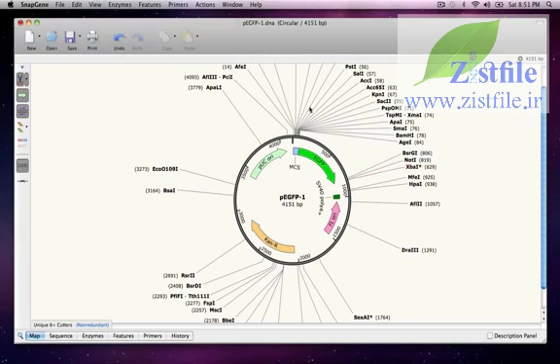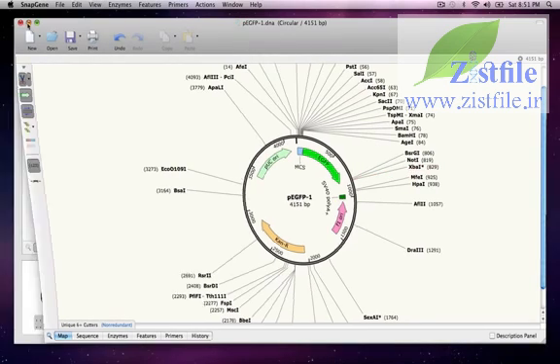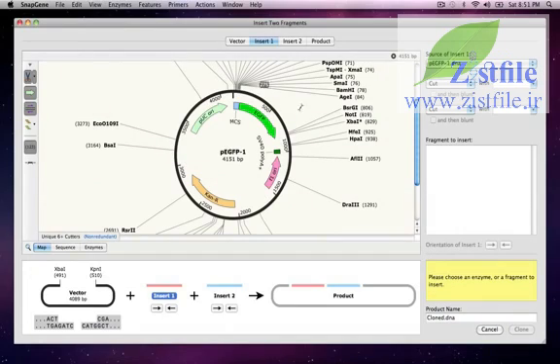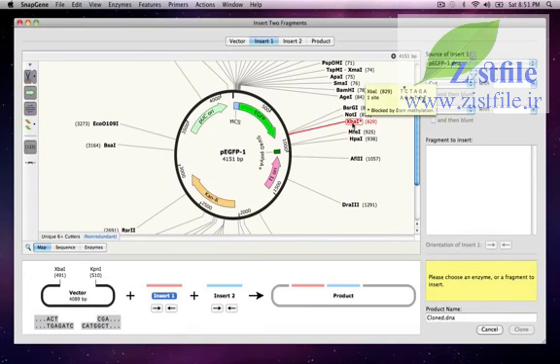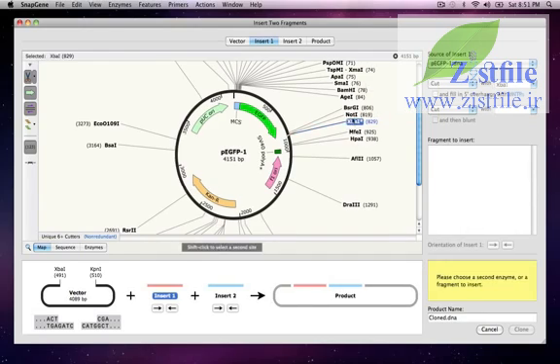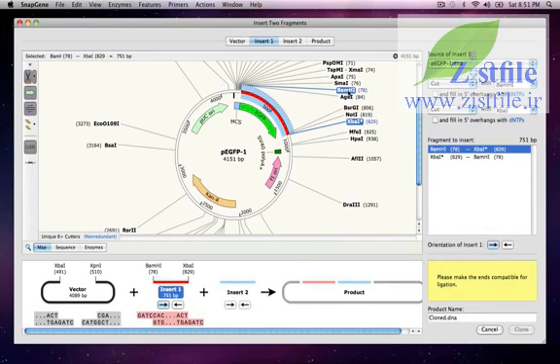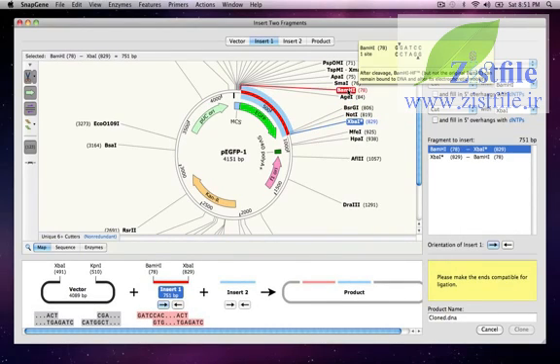Now when I switch back to the cloning window, I can click to select that XBAR1 site, then drag upward to select the BAMH1 XBAR1 fragment containing EGFP.